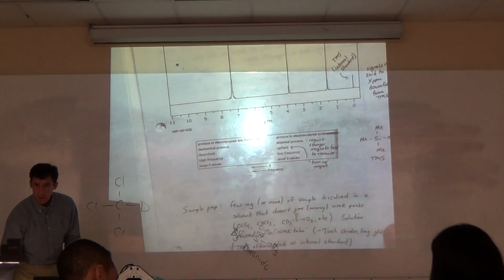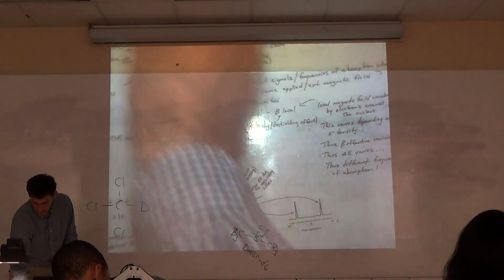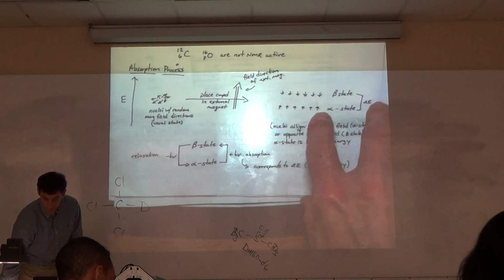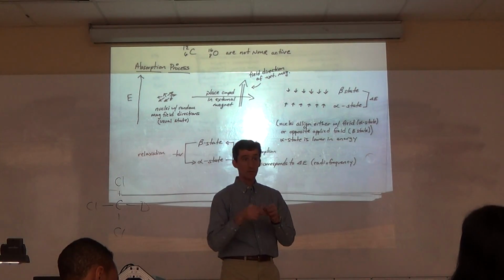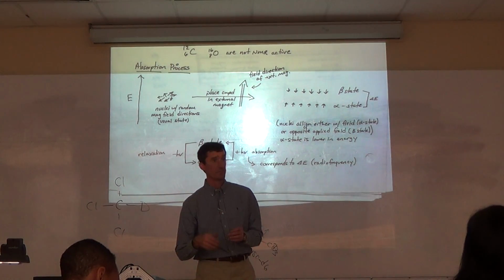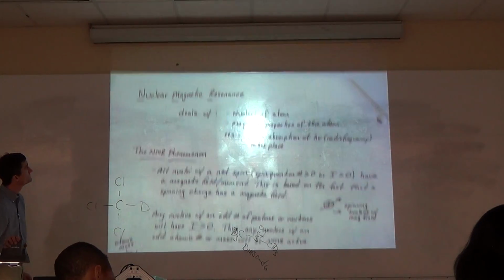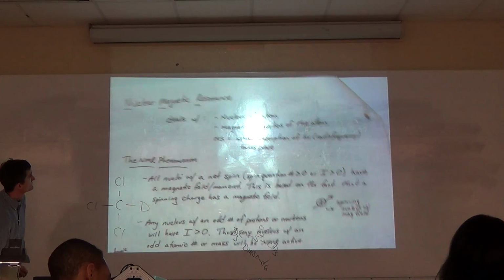Anything on that page before we turn? We add the TMS to that mixture. Oh yeah, I think it says that at the end. Typically, once you dissolve it, you can then add a very small drop of TMS. Sometimes your solvents come with TMS already in. Okay.